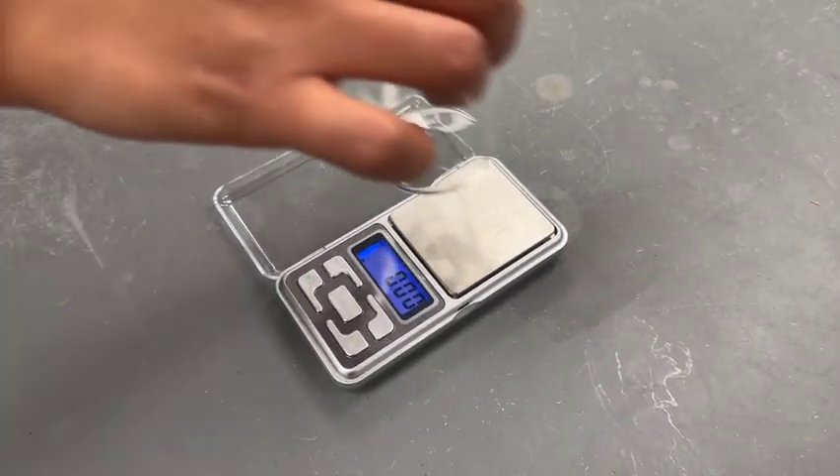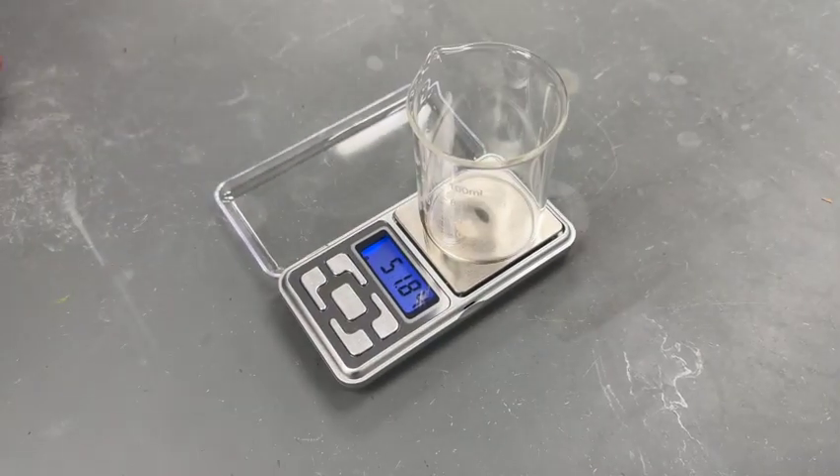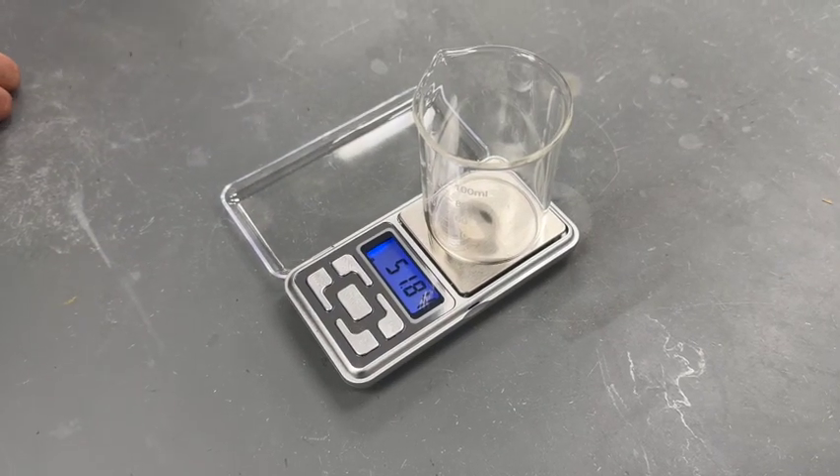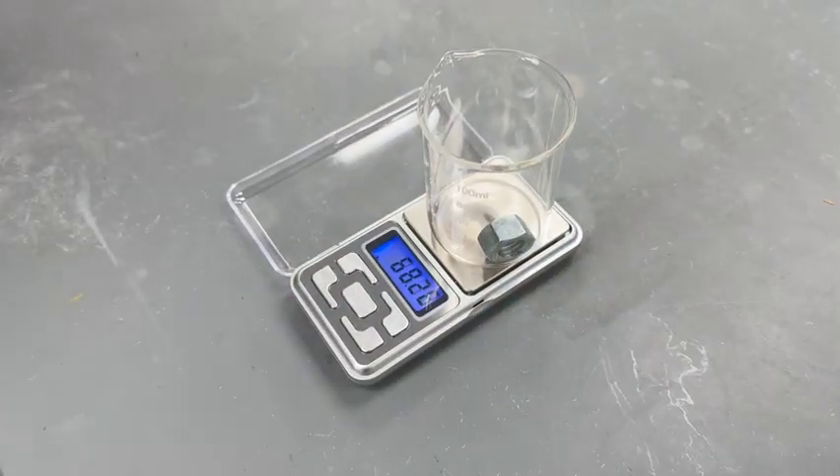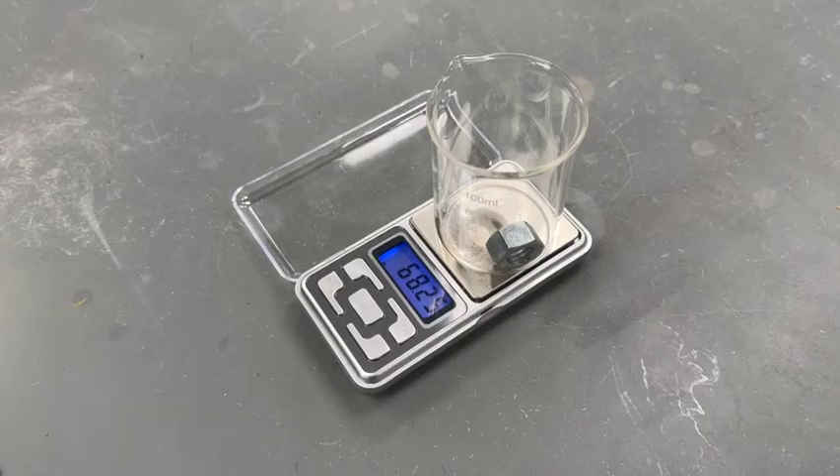To weigh the solid indirectly, place a 100 milliliter beaker on the balance and record its mass. Place the solid in the beaker and record the combined mass. Calculate the mass of the solid by subtracting the mass of the empty beaker from the combined mass of the beaker and solid.